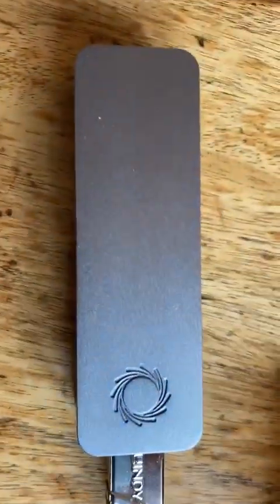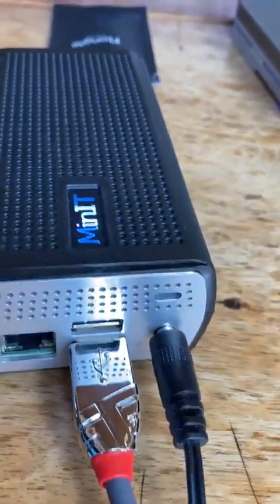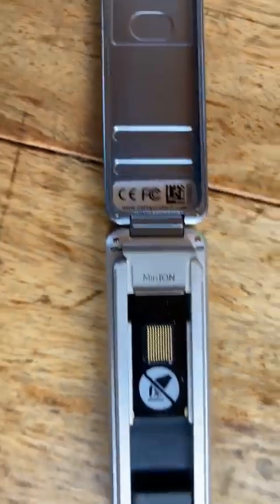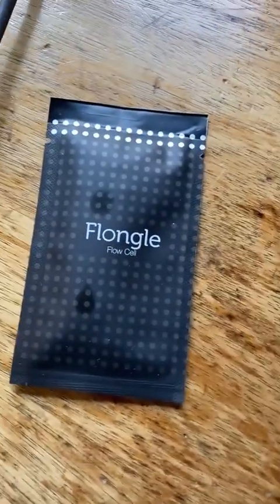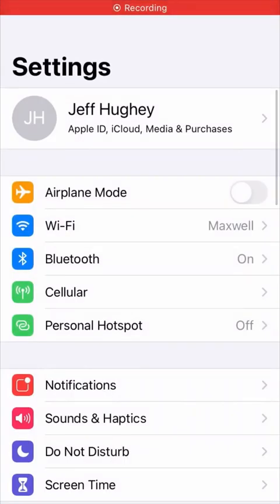And this is the MinION sequencing device with a Flongle adapter on the inside. I have two of these, because I'm going to run two devices. There's another MinION device with a Flongle adapter to take the Flongle flow cell. The flow cells come in these little packets. The first thing to do is to test the flow cells.